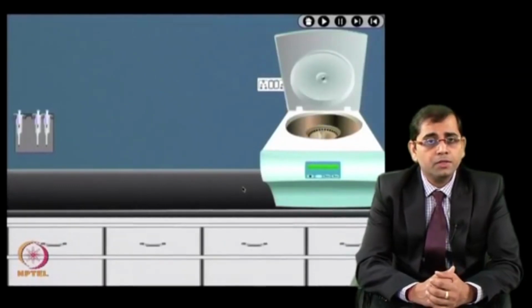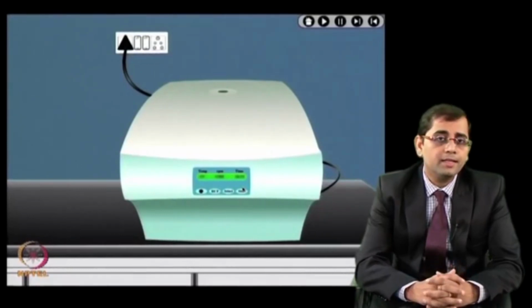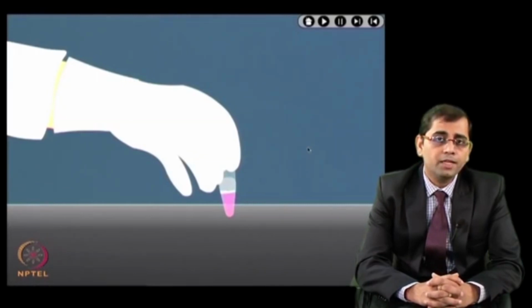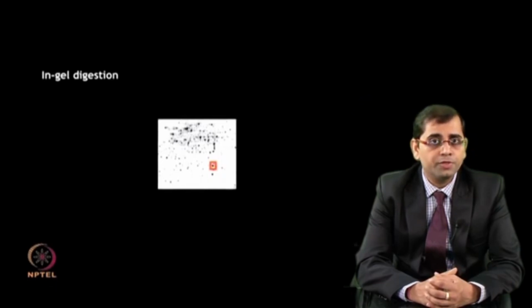We'll continue the protocol standardization using bacteria and discuss cell lysis, protein precipitation and quantification, and the TRIzol extraction protocol. In lecture 4, we'll talk about in-gel digestion or in-solution digestion of the protein, which is essential prior to the mass spectrometry analysis.